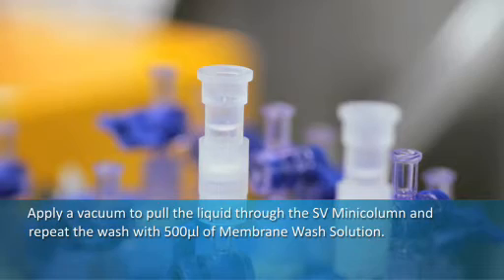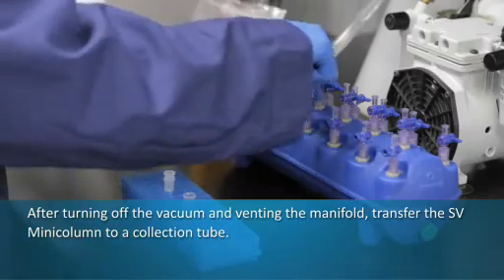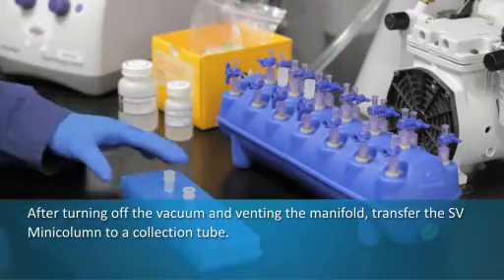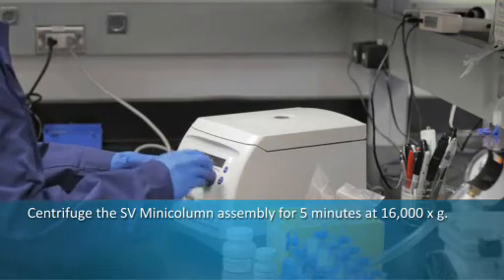After turning off the vacuum and venting the manifold, transfer the SV mini column to a collection tube. Centrifuge the SV mini column assembly for 5 minutes at 16,000 times gravity.